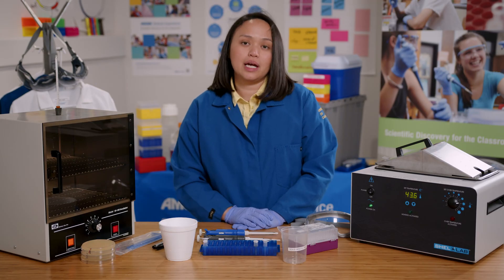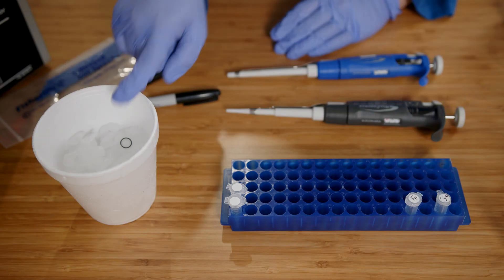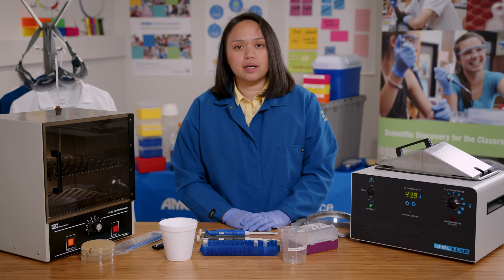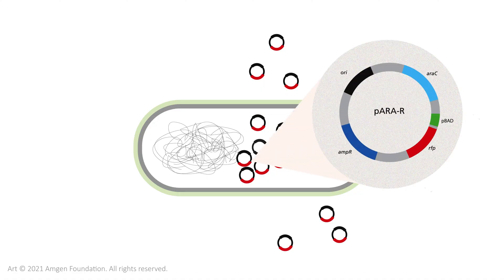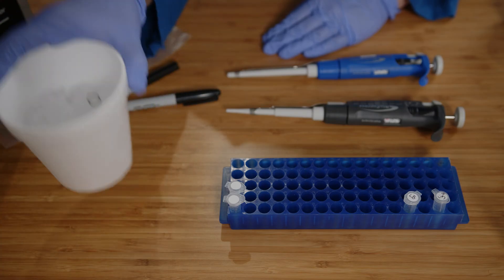Here are the reagents and equipment that I will be using. I'll start off with two tubes: my competent cells and my lig tube. The competent cells are E. coli cells that have been specifically prepared to take up the plasmid. The lig tube has the plasmid that I made in labs 2 and 3. I'll combine the competent cells with the plasmid and keep them on ice.